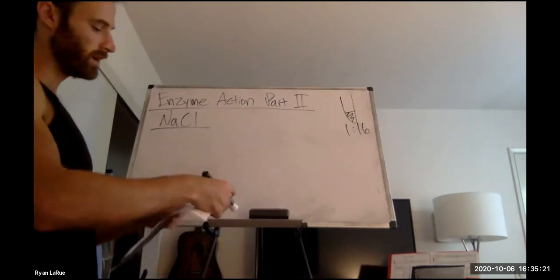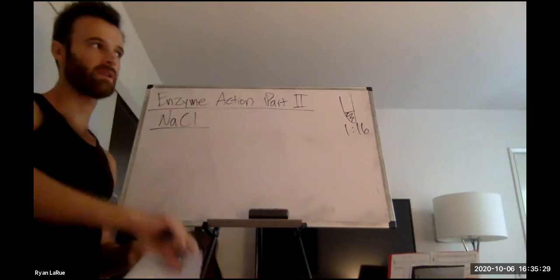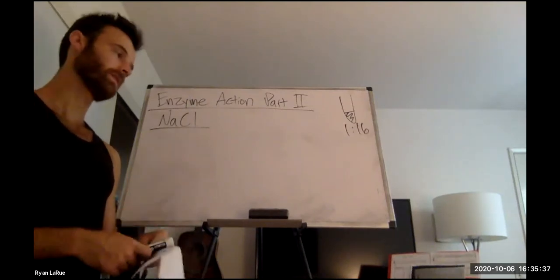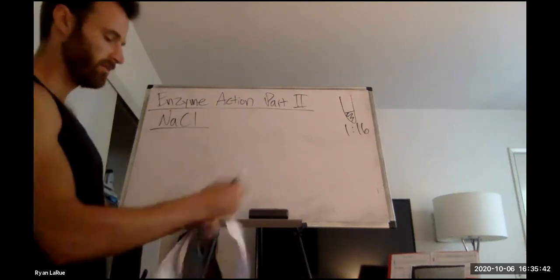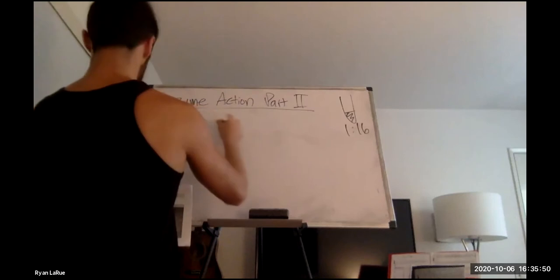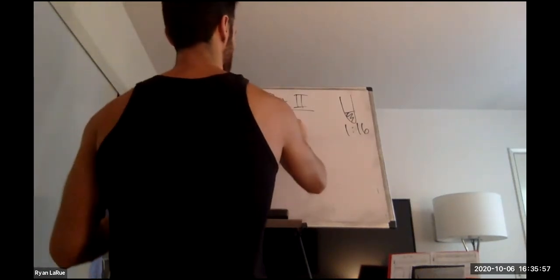What you're gonna have is a positive control and a negative control. The reason for this is you want to make sure your chemicals, your reagents are working properly, and they also give you a point of comparison, and I'll explain that. But for your negative control, let's start with that.